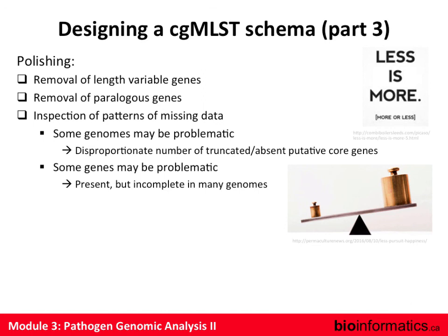Exhaustion, and it takes a lot of effort to do that. For Neisseria, for Neisseria gonorrhoeae, it's one of the most popular types of Neisseria. It's a labor of love to do that, quite frankly. Right. So just be aware, like anything, if you're using a schema, make sure that it's a good one, because there are going to be different ones that people like.